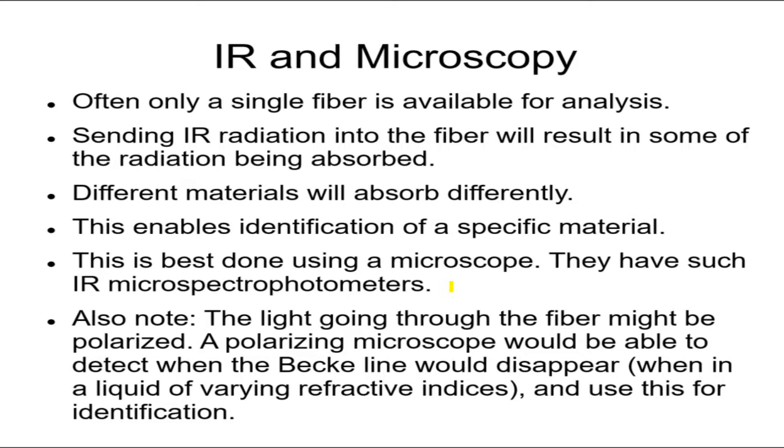You might be able to prove that it is this brand of shirt only that uses that dye, and that is connected to the crime scene. It doesn't prove that what the suspect had was from the crime scene. It just proves it was the same kind of fiber from the same exact manufactured shirt.